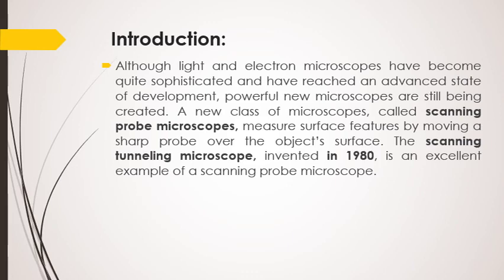This scanning probe microscope was basically invented in 1980 in the form of scanning tunneling microscope. That is the example of scanning probe microscope.